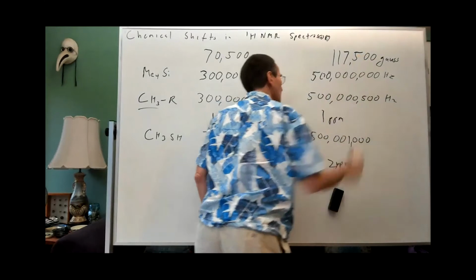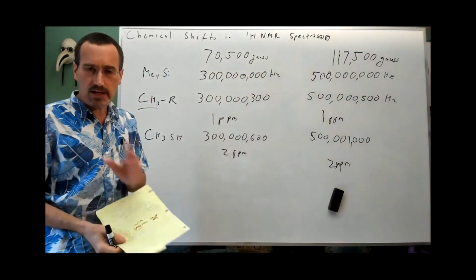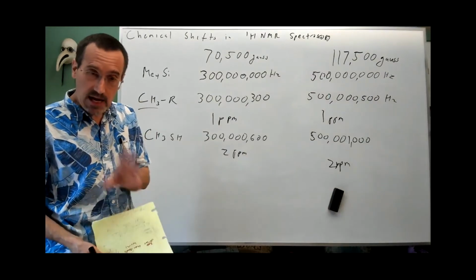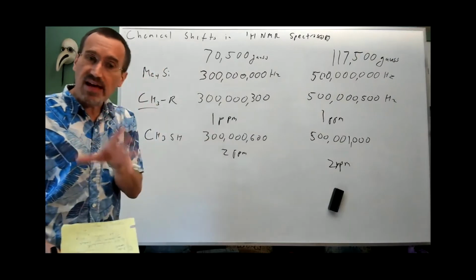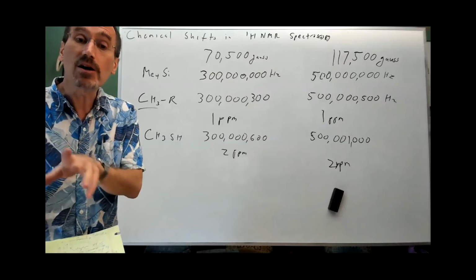Now, immediately, I want to point out one point, although we're not going to be talking about spin-spin coupling today. I want to point out that spin-spin coupling is invariant in hertz.